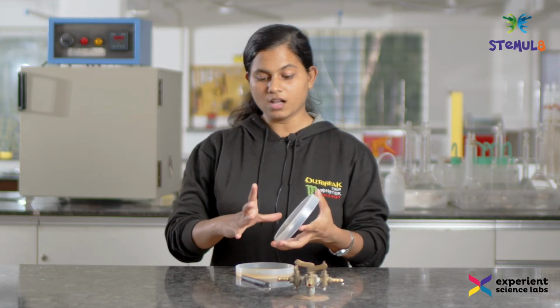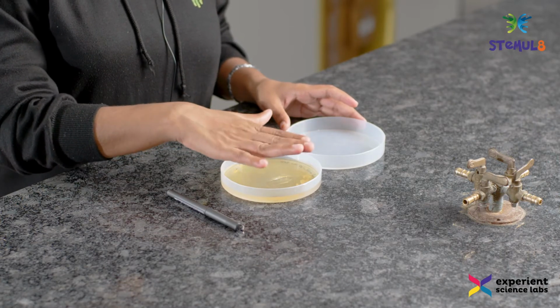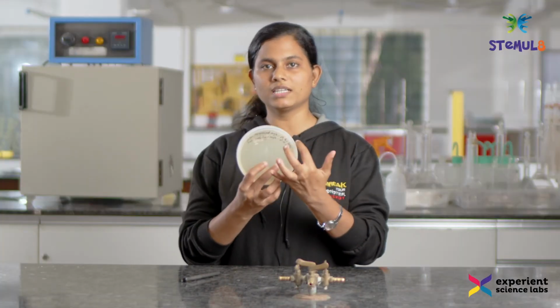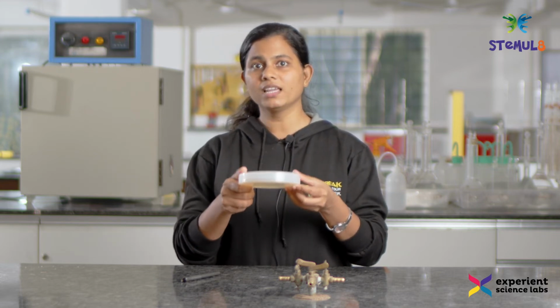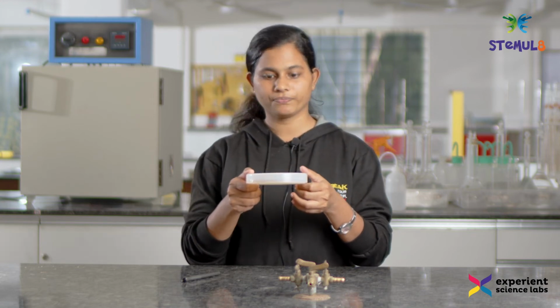One more thing that all of us must remember is that all bacterial culture has to be done in a sterilized chamber. Since it is for the sake of demonstration, I am just doing it here. I have imprinted my palm on this nutrient medium. I have labeled it and now I am going to incubate it so that the bacteria multiply and later it can be used for further studies.